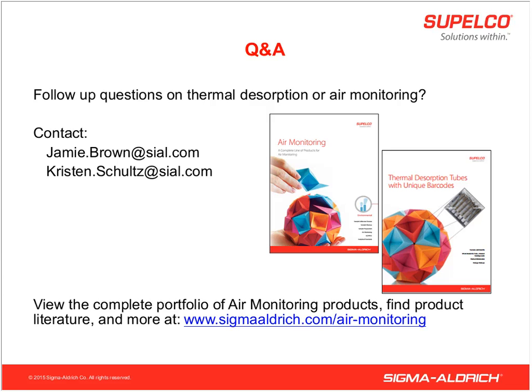Okay, and Richard's follow-up question is, can ORBO 42 tube packing be used on a thermal desorption unit? I've honestly never heard of that, so I'd be interested to follow up with Richard to get a little more information on that material, and maybe I could make a recommendation.